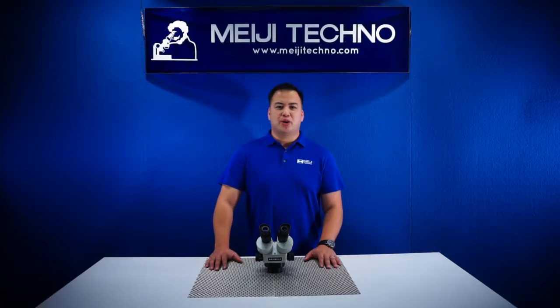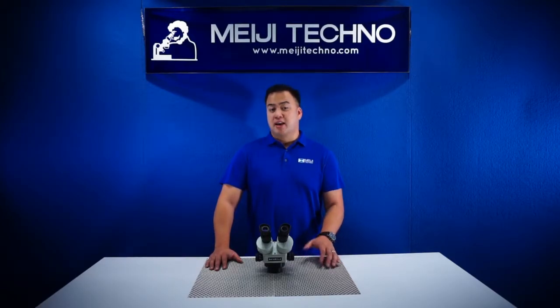Just like all our other models, our EMZ5 is built with an all-metal cast aluminum alloy finish with its chemical resistance finish and paint.